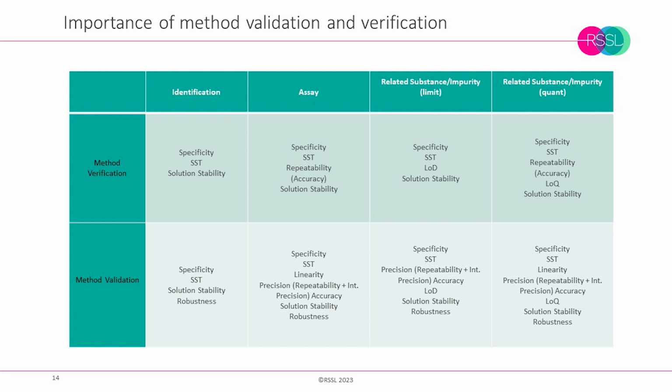You will notice that the number of parameters increase with the complexity of the test and reflect the requirements. For example, an assessment of LOD is required for a limit test, whereas LOQ, or limit of quantification, is required for quantitative assessment. For verification especially, there is the flexibility to add or remove parameters to meet a client's cost or timeline requirements. All testing plans for either verification or validation should be contained within a protocol document signed by both the client and the analysis provider prior to commencement of the exercise.